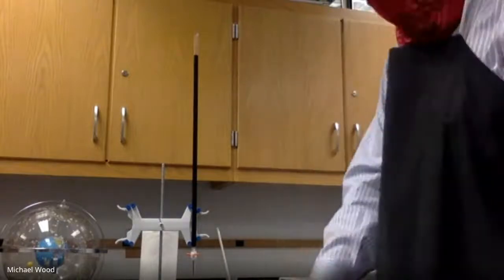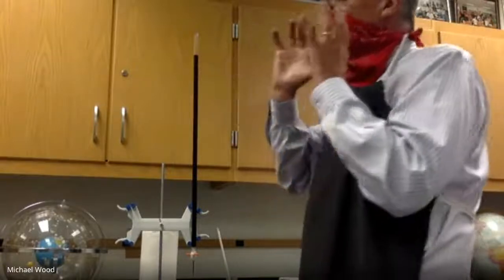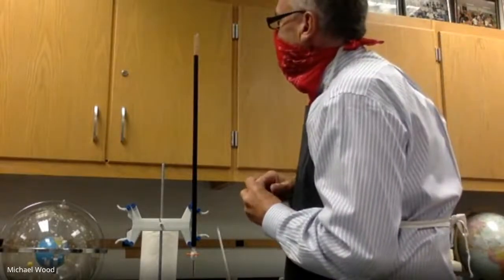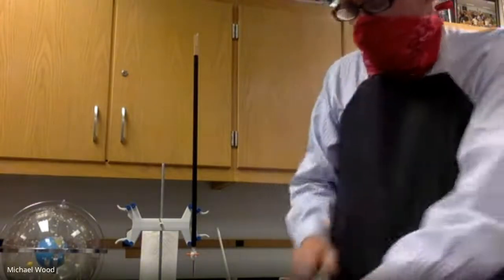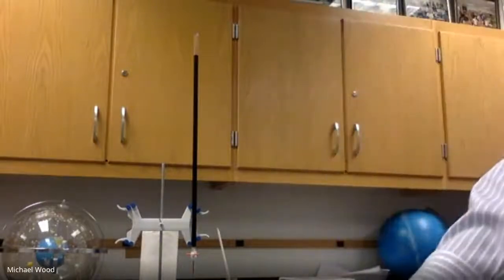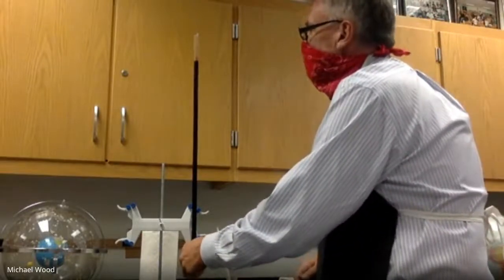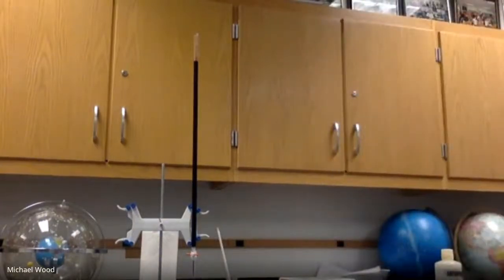Okay, so now we're going to make our initial reading. Following the rules of sig figs, this goes to the 10th, so I would want to go to the 100th. So I'm going to say 0.35. So I'm going to write that down up here. Tell you what, I'm going to actually change that just a little bit. I just want to get one more sig fig. So let's go 2.10. And I'll show you guys on my cohort here in a second, but the initial volume of the KMnO4 is 2.10 mL.